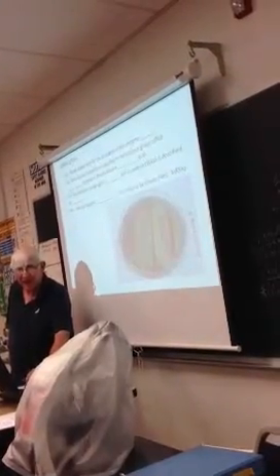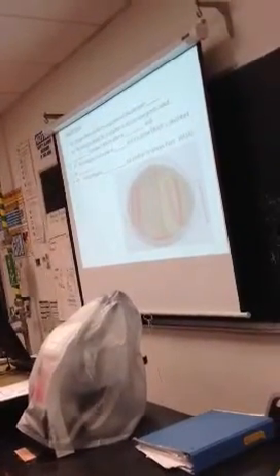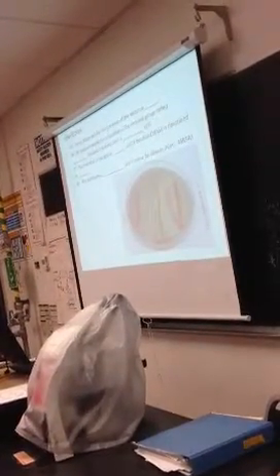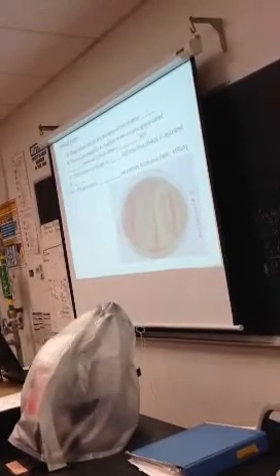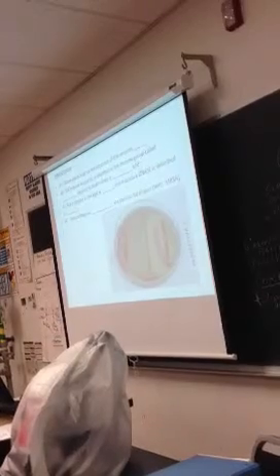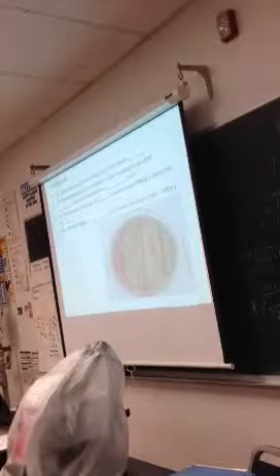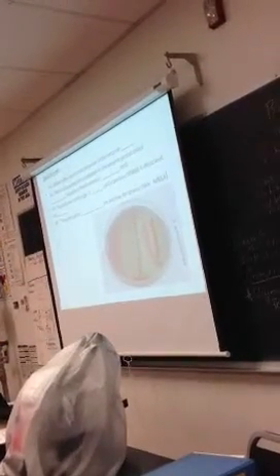TSI, phenylalanine. Here's our DNase plate. DNase plates test for the presence of the enzyme DNase. What's the DNase plate? The enzyme tested for is classified as an enzyme group called blank because it breaks down blank. A nuclease because it breaks down a nucleic acid. What's the indicator? What's the chemical dye that gives the color?